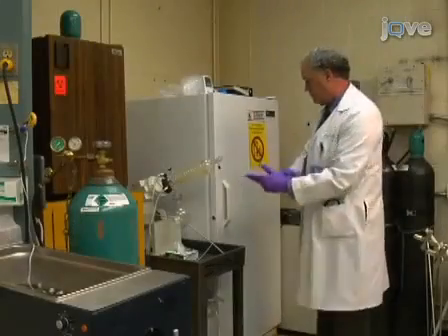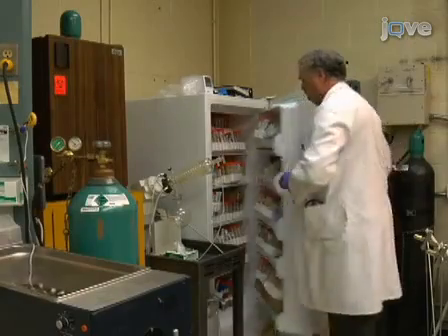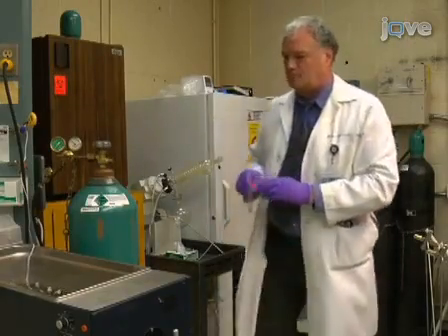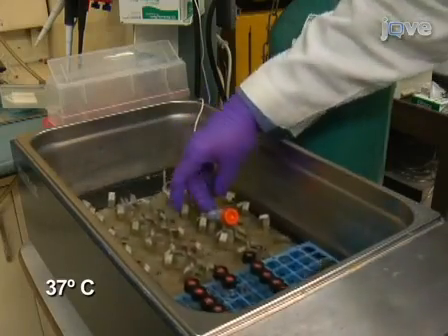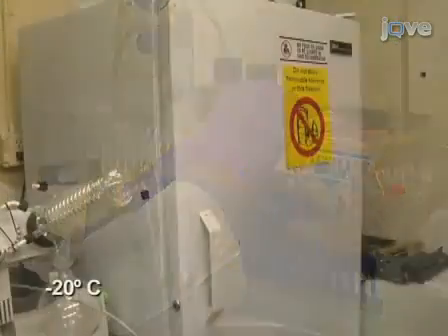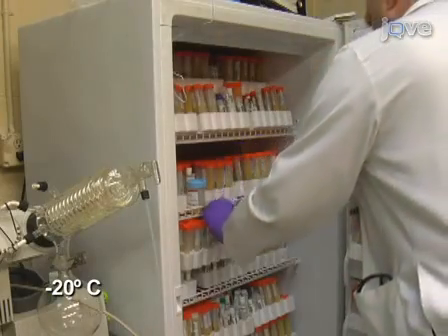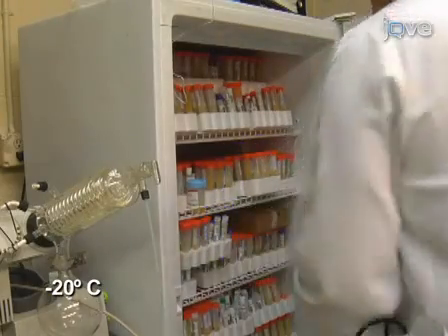To begin this procedure, thaw the urine sample in a 37 degrees Celsius water bath. If the original container is compromised, decant the sample into a new container. Take an aliquot of sample and store it at -20 degrees Celsius in a labeled conical centrifuge tube as a backup.